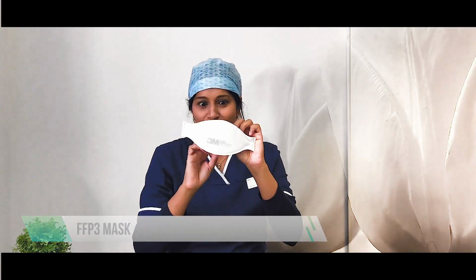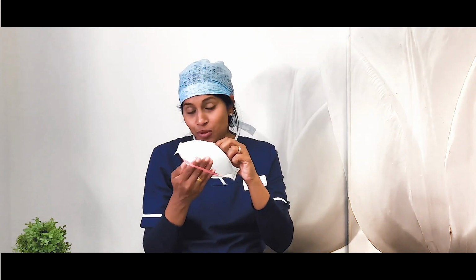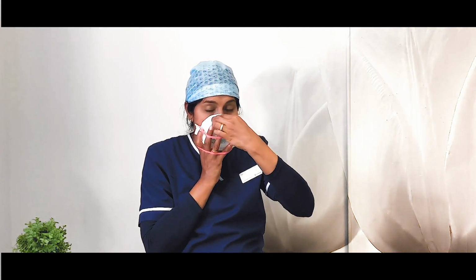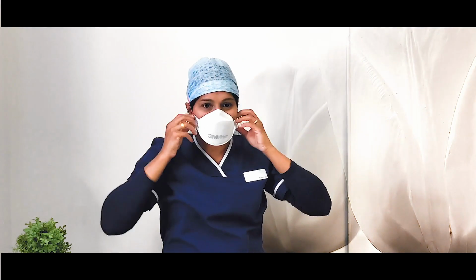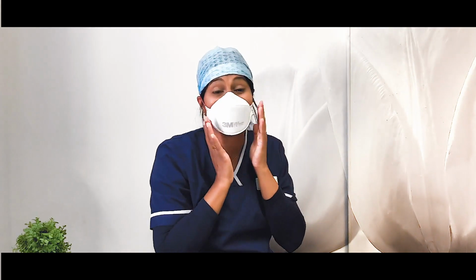Now coming to the disposable FFP3 masks, the king of it all is the 3M FFP3 mask, the foldable. It comes as a foldable one, and this is supposedly the best one, which fits almost everybody. It's most comfortable. It is quite expensive, so all you do is you put it on, and then you put the head ties on, one on the crown and one at the back, and you adjust, and the fitting is really good.